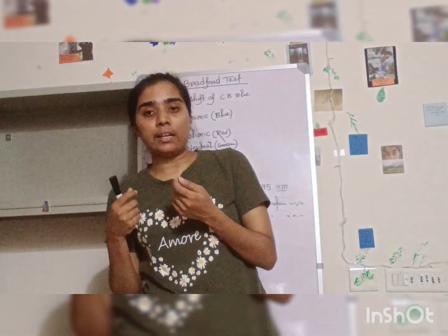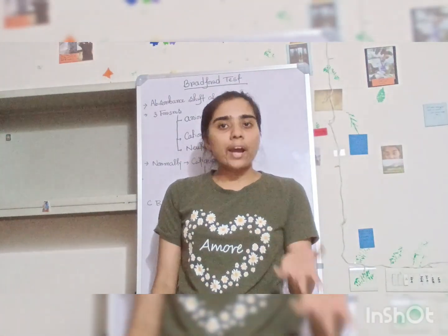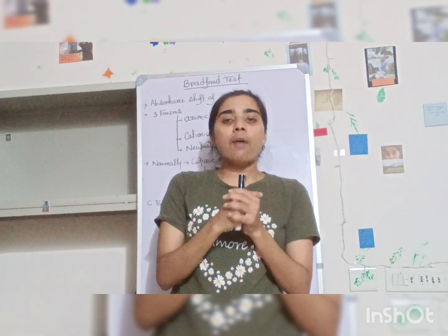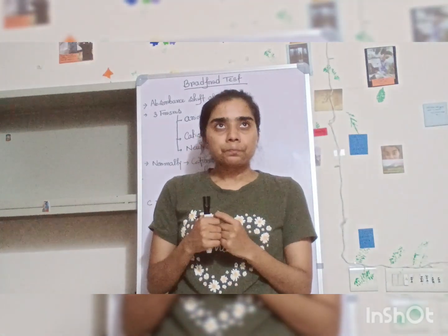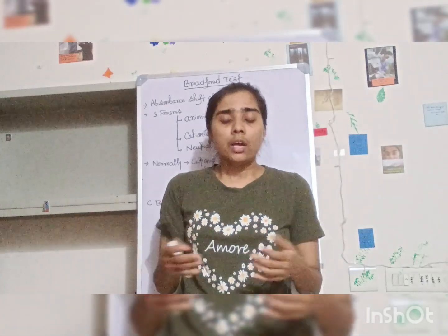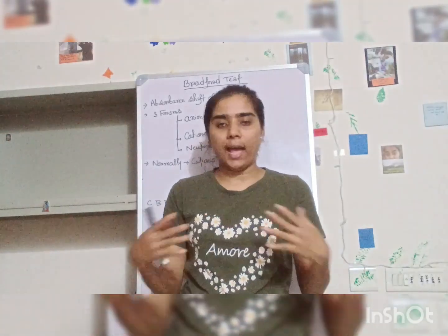Now it is nothing but one dye. The Bradford reagent is commercially available in the market. You can purchase it, and there are two kinds of Bradford reagent available: one is non-diluted and one is diluted. If you purchase the non-diluted one, you have to dilute it first and then use it for your assay. And if you don't want to dilute your reagent or do any kind of preliminary things before using the Bradford reagent, you can just buy the diluted Bradford reagent and do the assay directly.